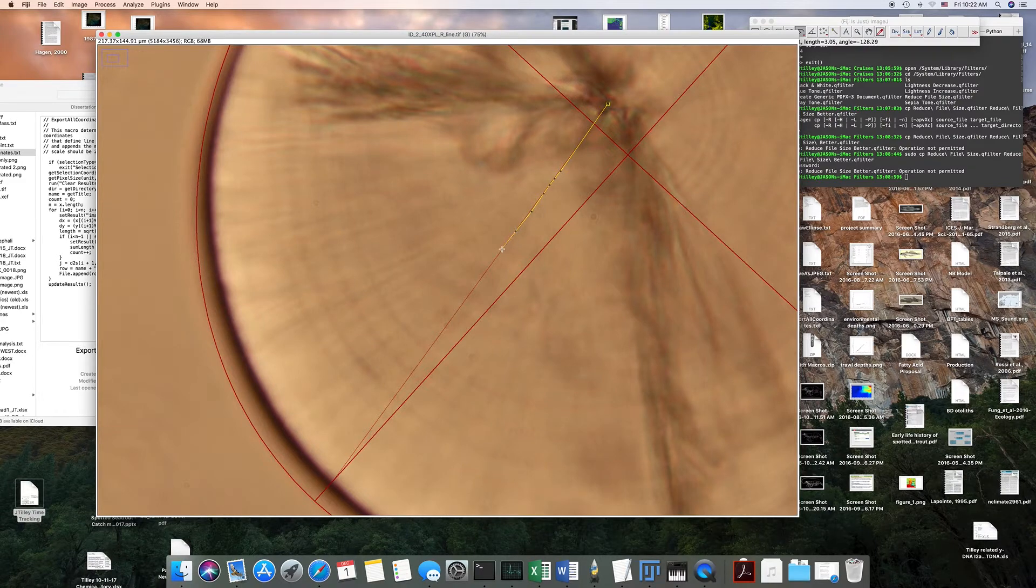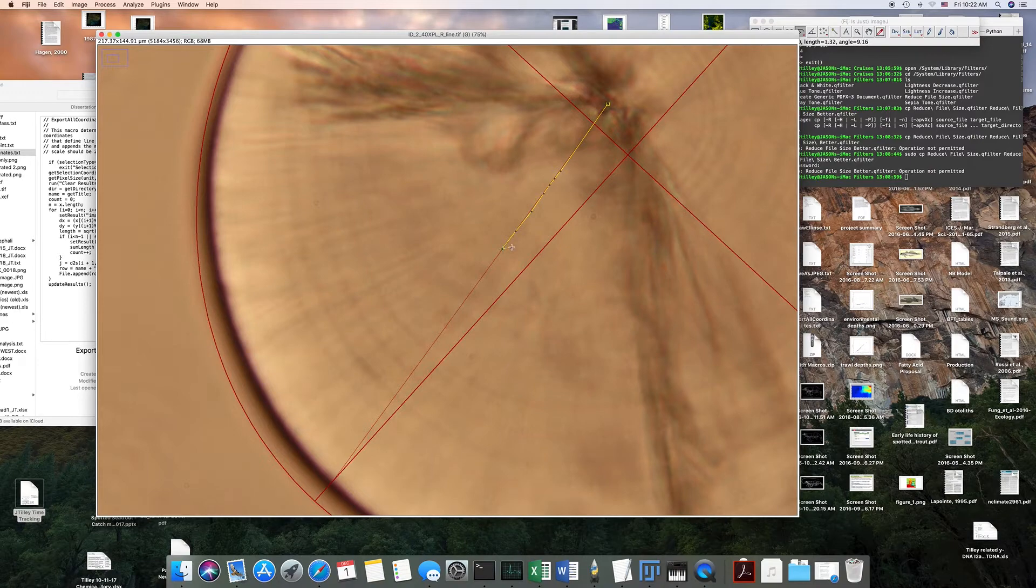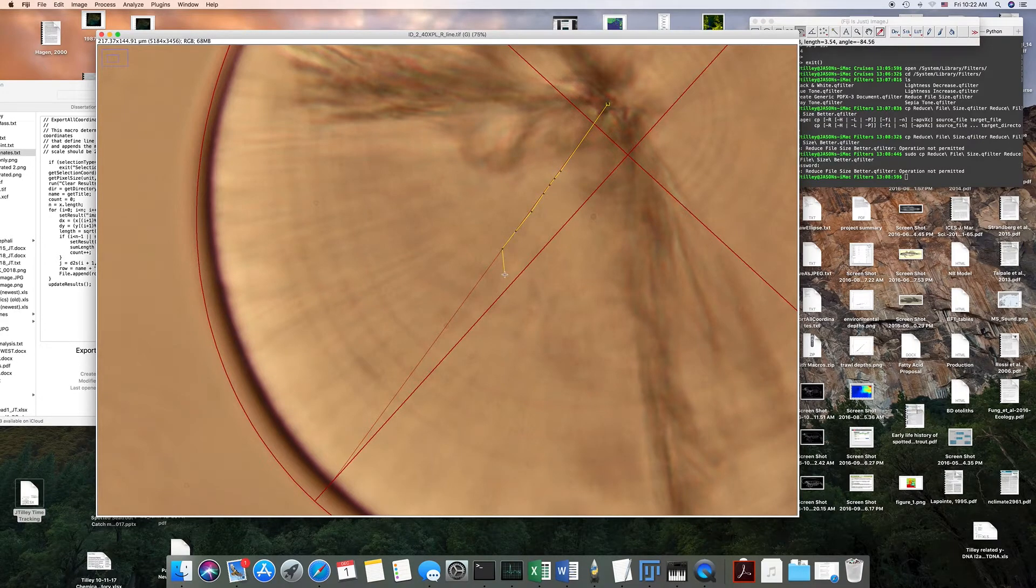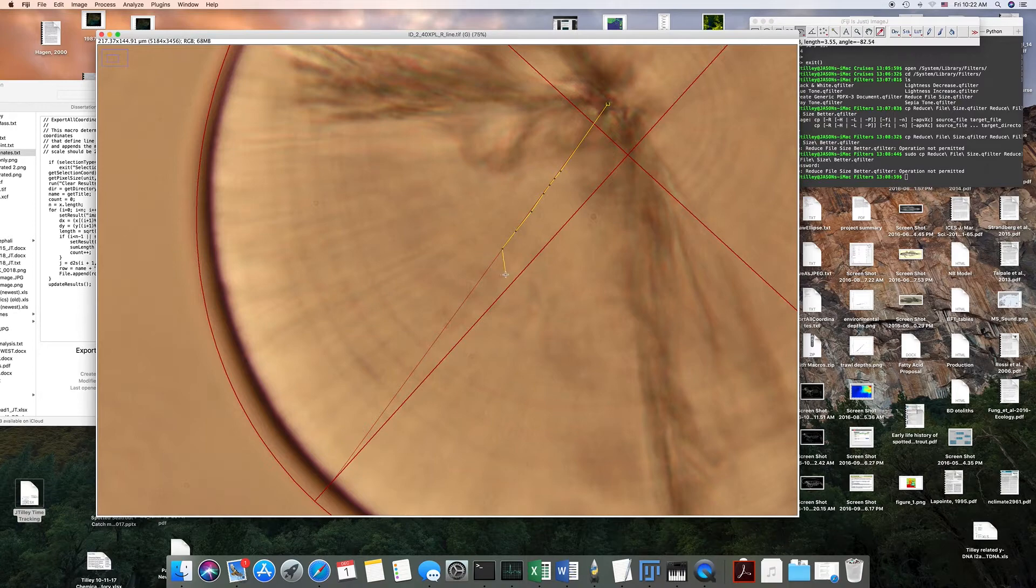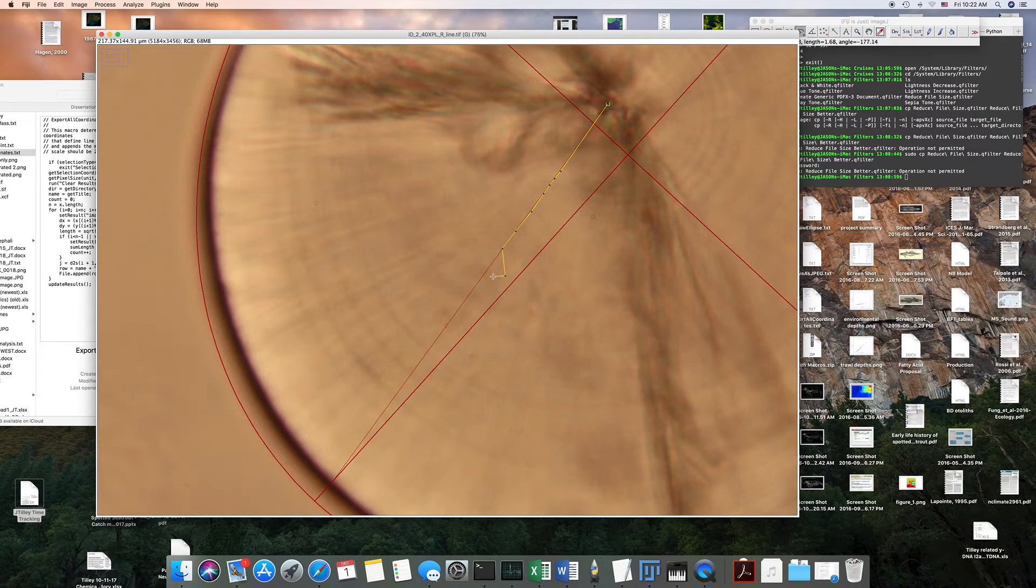Don't right-click, don't click off of it. If you need to come over here, if you can see something better on the side, you can do that.